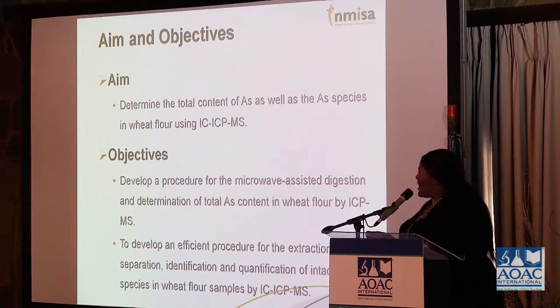This has led to the aim of my study, which is to determine the total content of arsenic as well as the arsenic species in wheat flour using ion chromatography coupled to ICP-MS. And to do this, I'm going to develop a procedure for the microwave-assisted digestion and determination of total arsenic content in wheat flour and analyze using ICP-MS, and then develop an efficient procedure for the extraction, separation, identification, and quantification of intact arsenic species in wheat flour samples by ion chromatography ICP-MS, with the keyword being intact arsenic species.